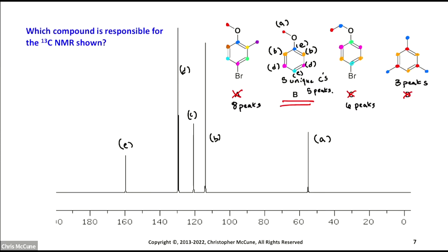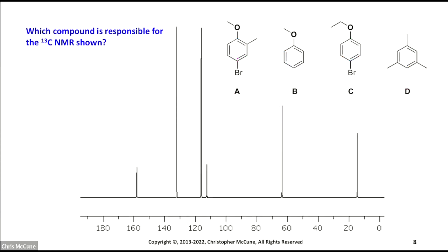So I have one more to practice here. I've got how many peaks? Let's decide. I've got 1, 2, 3, 4, 5, and let's say, I think I have 6 peaks there.